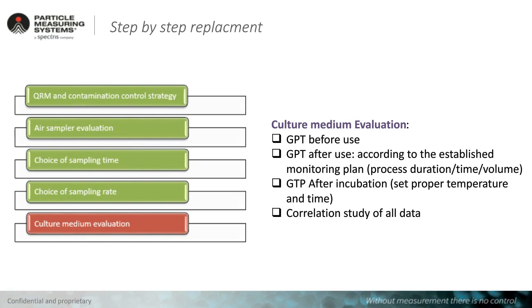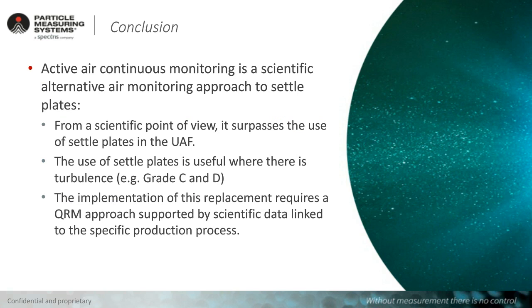As a conclusion, from a scientific and literature perspective, we need to understand that settle plates in unidirectional airflows and in critical environments are not really a favorable methodology.